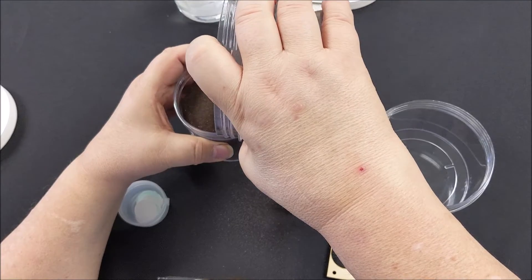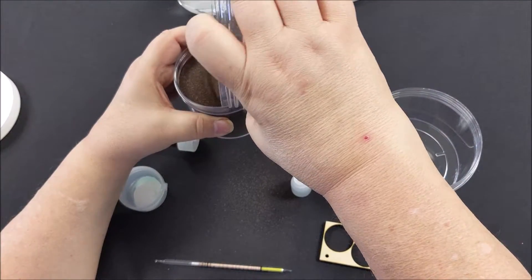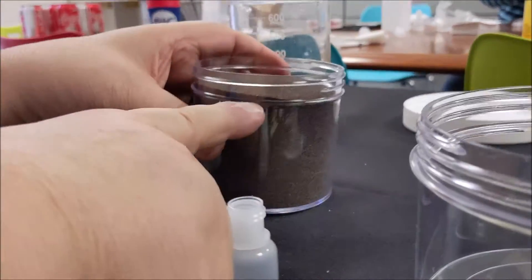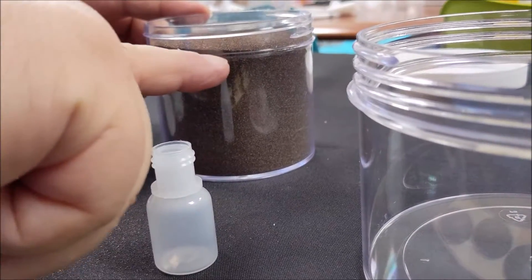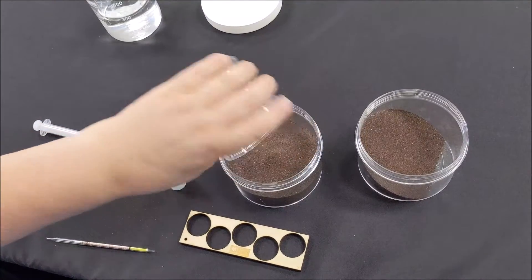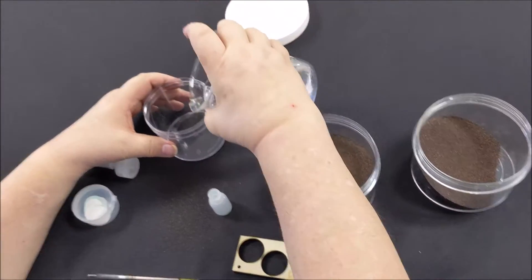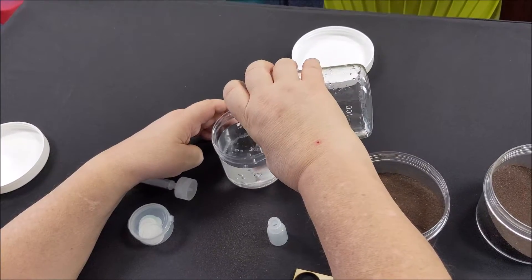Fill the small jar to the neck with abrasive to be tested and then add to the large jar. Then fill the small jar to the neck with distilled water and add to the large jar with the abrasive.